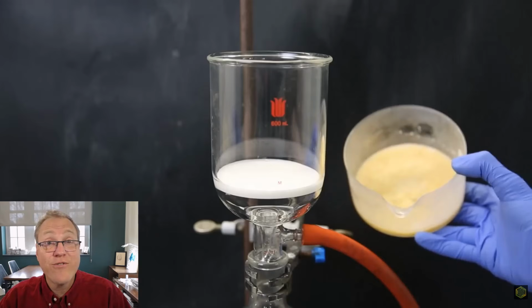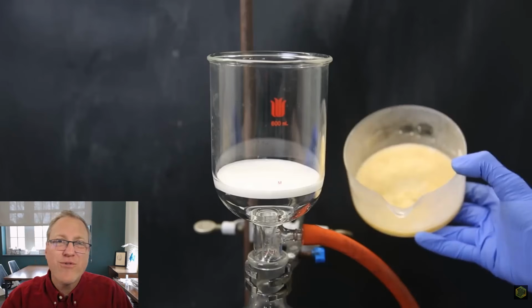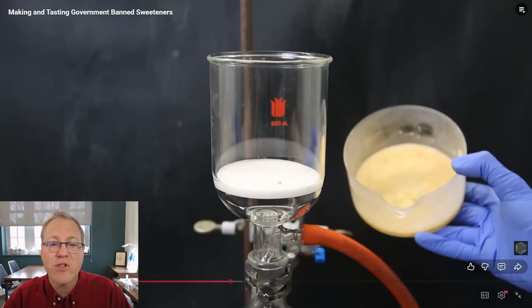Okay, that's nice. Okay, it's all solidified. Now, I know it looks like that's one big mass of solid. There is a lot of liquid, all that solvent trapped within that lattice. So when he filters this, there will be some liquid in there to remove, and presumably that liquid will contain a lot of his impurities, leaving behind his much cleaner solid.